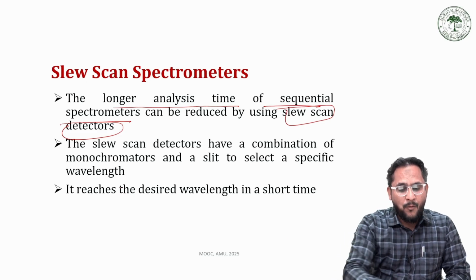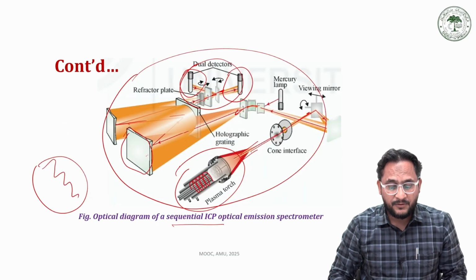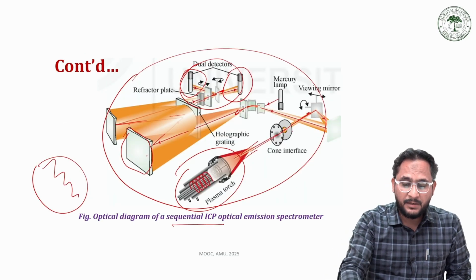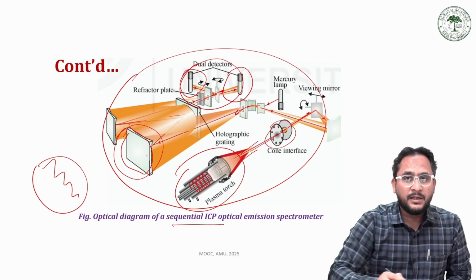Because in the previous case, we have to change the position of these slits every time in order to select a different wavelength.